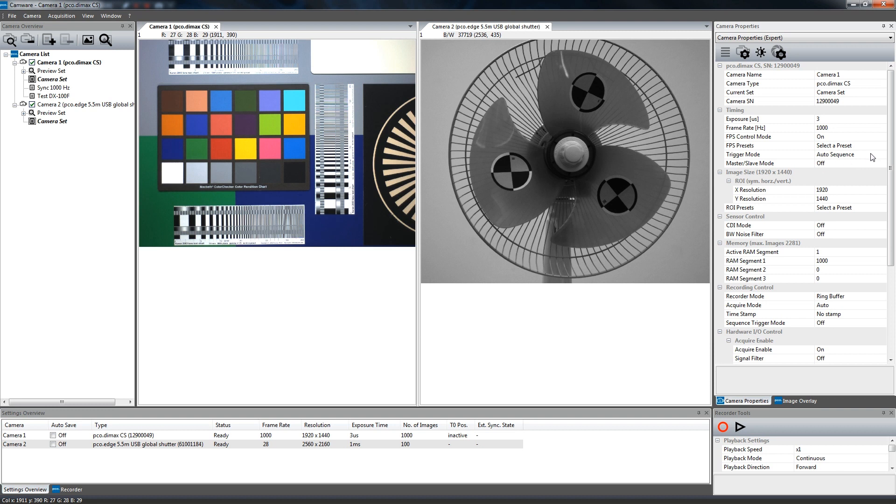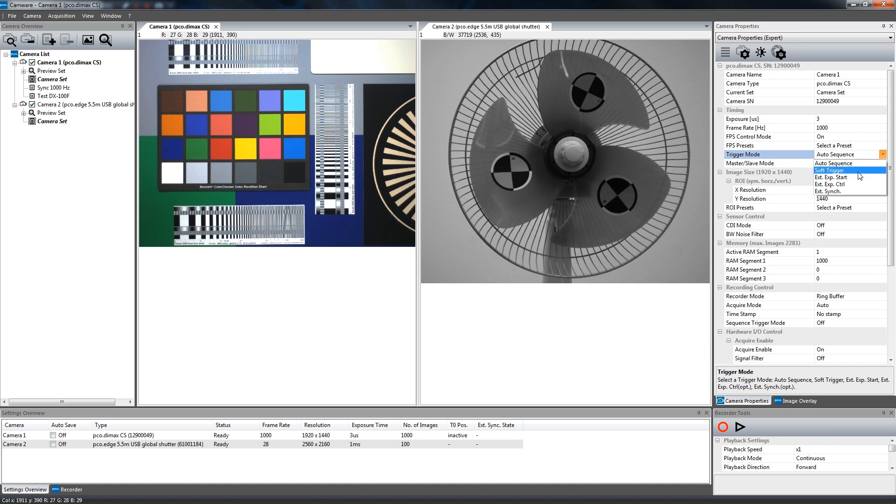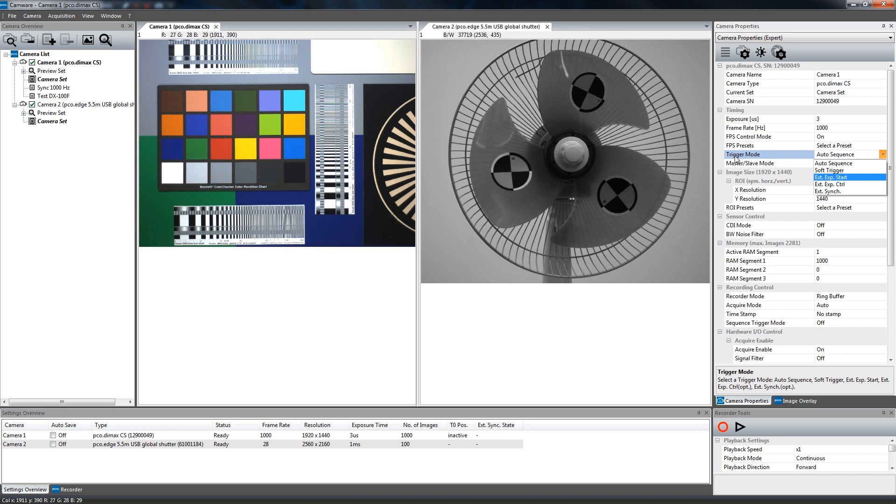For triggering the exposure of an image, select one of the trigger modes available. In Auto Sequence mode, the image recording is optimized by the camera to achieve the best possible frame rate. Soft trigger mode only records single images. In the external exposure start exposure control mode, image recording is started by the falling or rising edge of the voltage signal at the exposure trigger input of the camera. Other trigger modes are available depending upon your camera model.